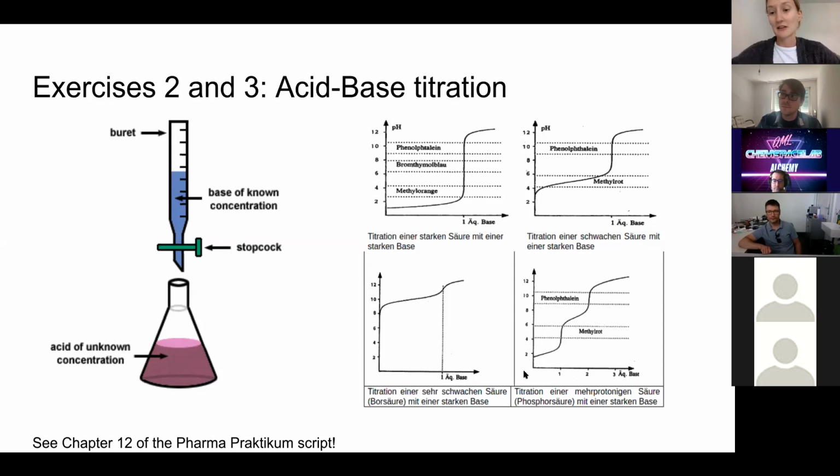So here you can see there are actually 2. So you see 2 of these inflection points where they're exactly the same as they were in the previous plots, you just have 2 of them. So that indicates the pH rapidly changing at 2 different pH values.